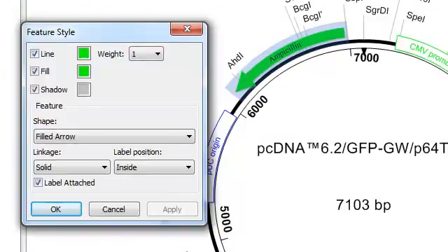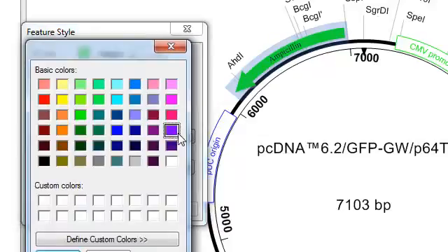Which allows me to change virtually anything about the way the feature appears, including the shape, the line color, the fill color. I'm going to change the fill color to purple.